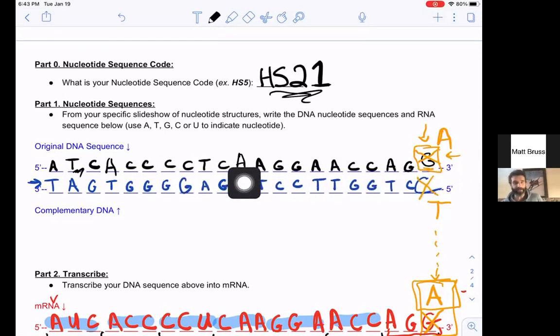Now one of the problems I've been having is splitting my screen and then the video going off. Bummer. So I'm going to try to do this another way. I want to just make sure that this is all still working. Okay, and can I find my particular sequence? I'm pulling up the sequence on the computer over here. And there we go. Okay, so now I'm going to go back over.